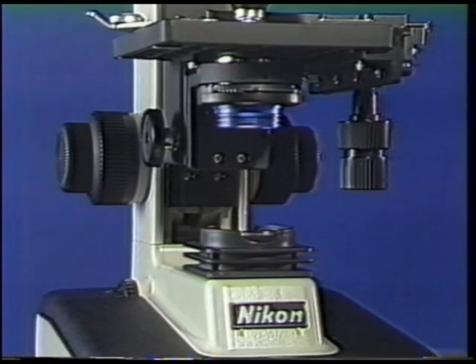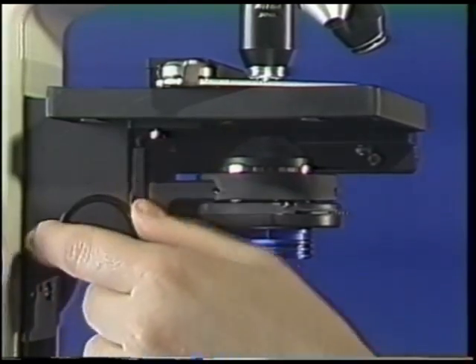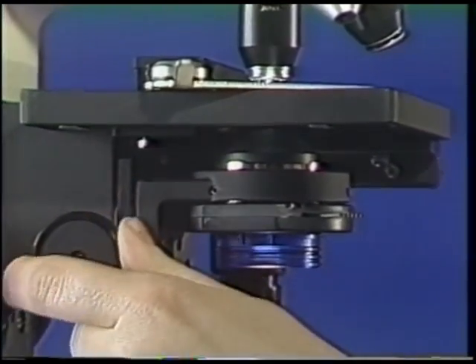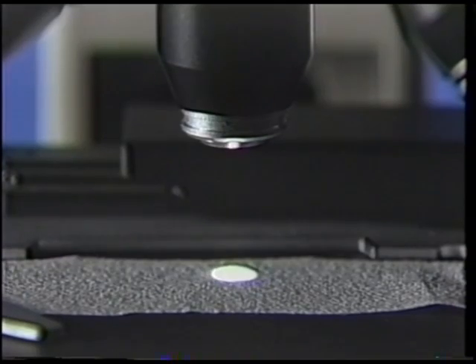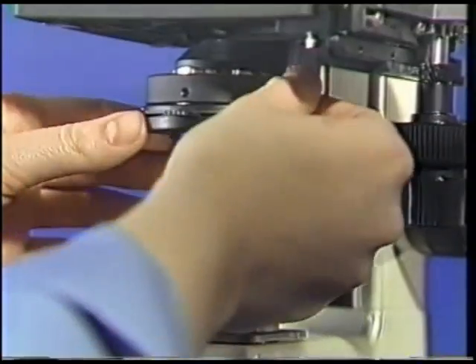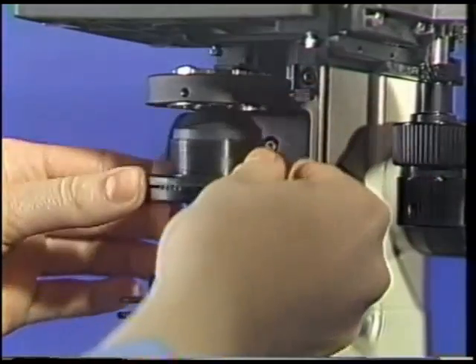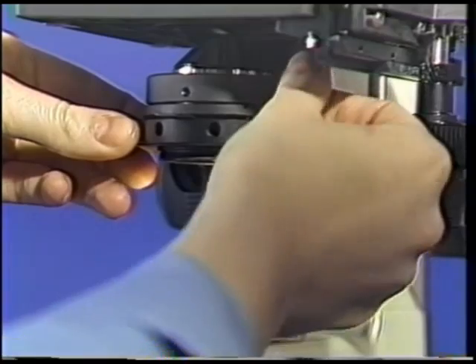Adjacent to the X-Y travel knobs is the condenser region. By moving the condenser focus knob, the condenser is moved vertically to focus the light onto the specimen slide. One to two millimeters below the slide will provide optimum illumination conditions. Loosening the condenser clamp screw on the right side of the condenser mount allows removal of the condenser or replacement with a different type.